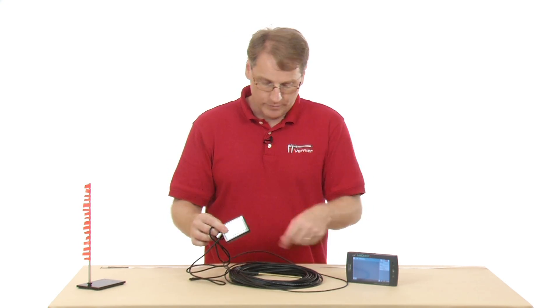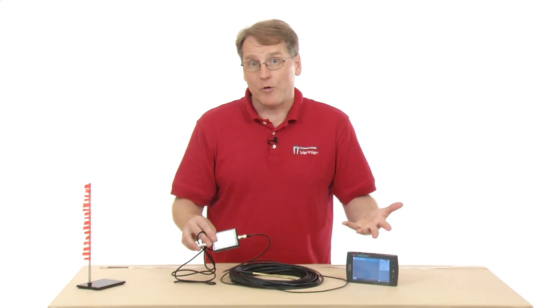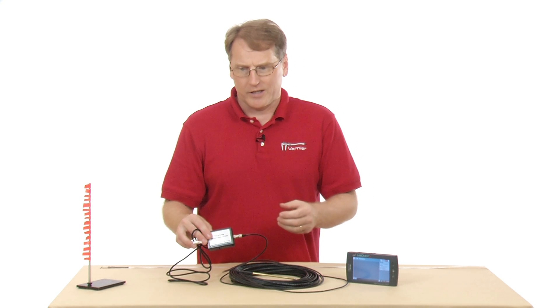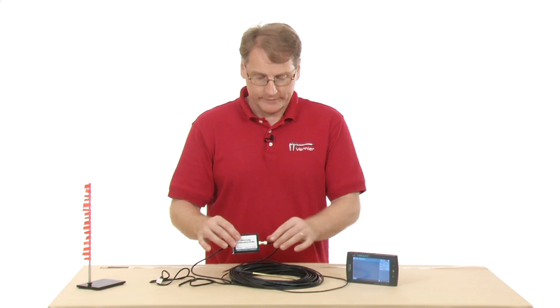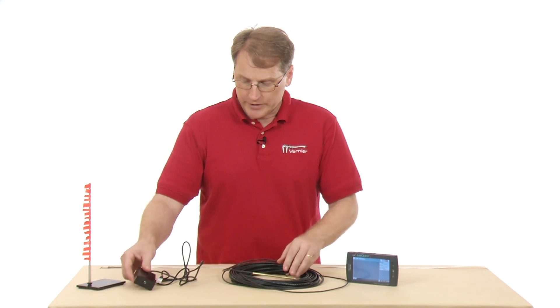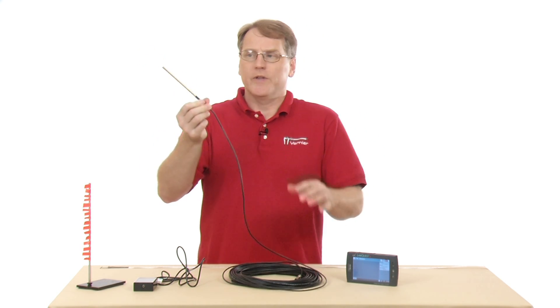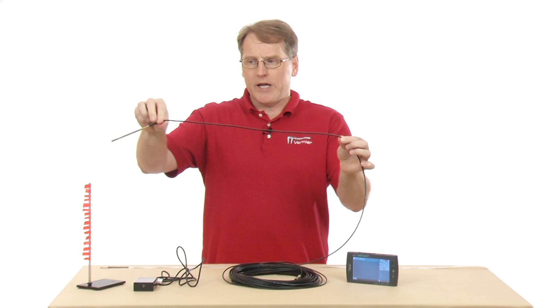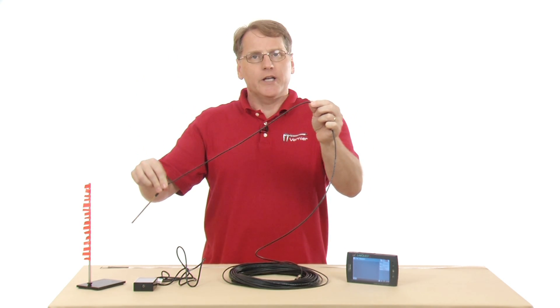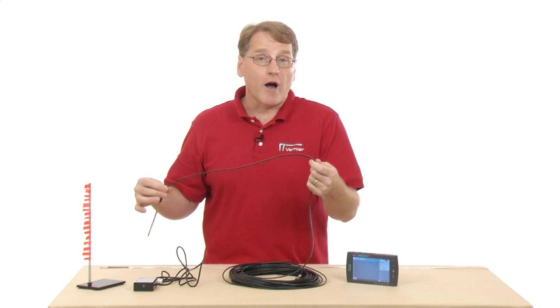You plug that in, and this plugs into your LabQuest. Now, before we go out to the pond today, what I'd like to do is mark off the temperature probe at different lengths, because we're going to submerge it into the water and take a temperature profile of the pond.